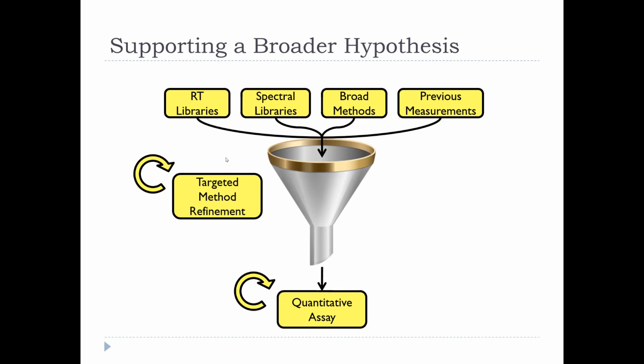we can take DIA, thanks to a lot of path-breaking work from a lot of the groups here, and definitely the Aebersold lab and the MacLean lab have been working very hard, as well as the Nesvizhskii lab and a number of labs, to expand DIA all the way to where you could just do it as a replacement for label-free DDA quantification. But there may be some sort of happy medium where we do some amount of refinement.